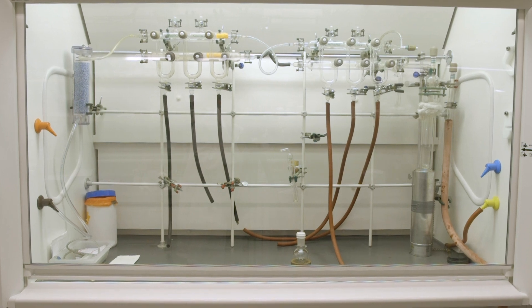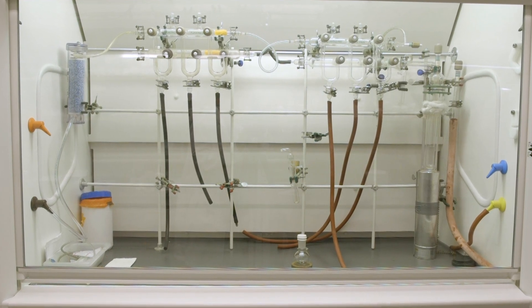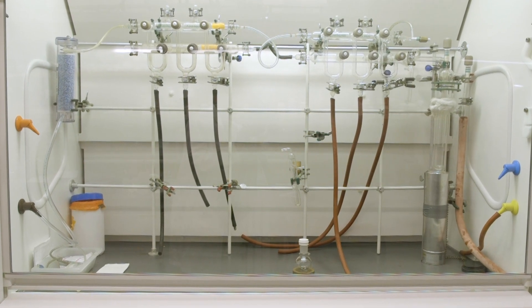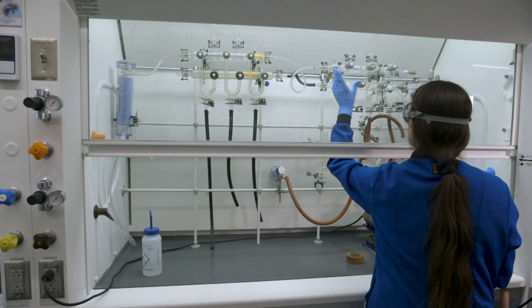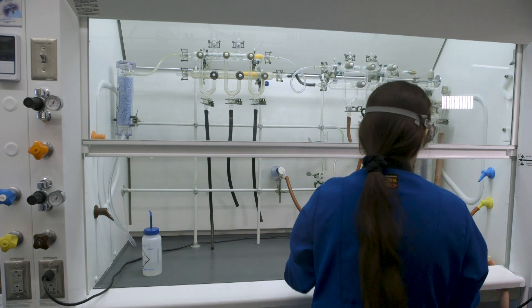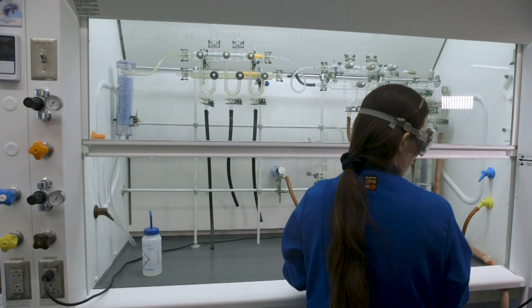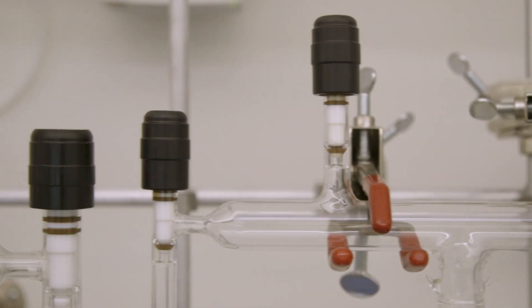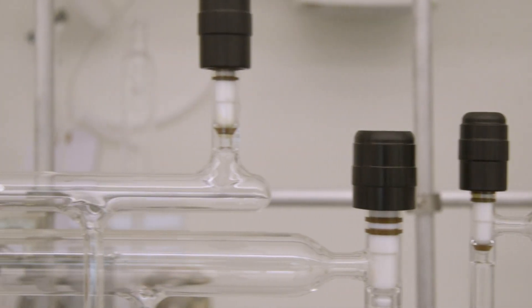A closed system inside a fume hood, such as a Schlenk line, is an alternative option for the use of pyrophoric materials. Many pyrophoric chemicals release noxious or flammable gases upon decomposition and are often stored with a solvent. Both are reasons which require the proper ventilation of a fume hood.